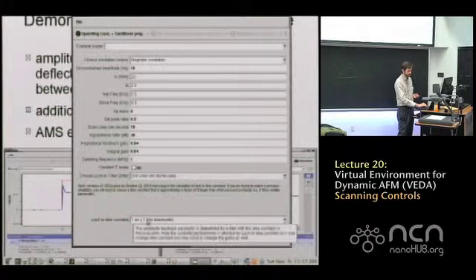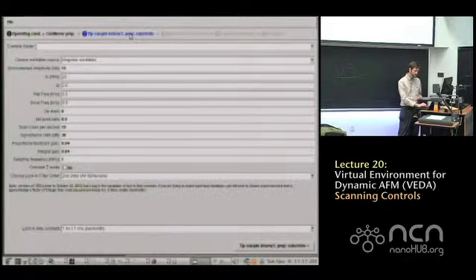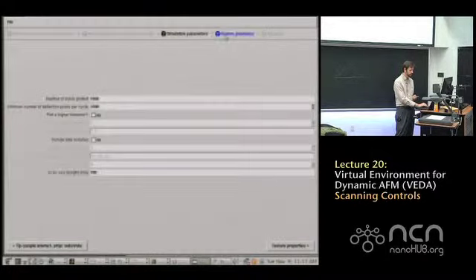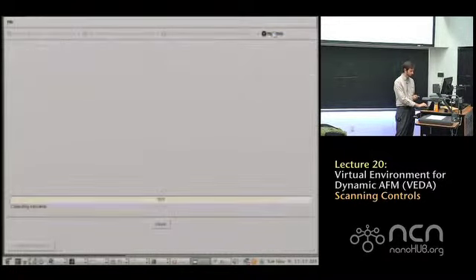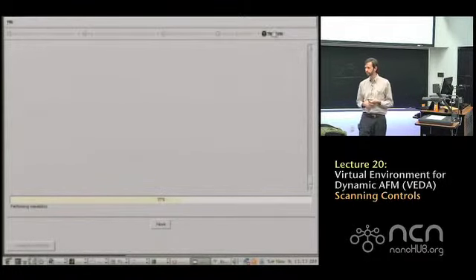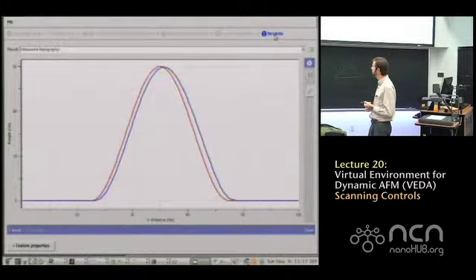Okay, I guess there is a lock-in time constant. Did you guys talk about lock-in amplifiers? Yes? Okay. So you also have lock-in filter orders and time constants down there. Everything else is exactly the same as the other tool. All the inputs are exactly the same. So we'll go ahead and run the default simulation. And then we'll talk about what all the different outputs are.